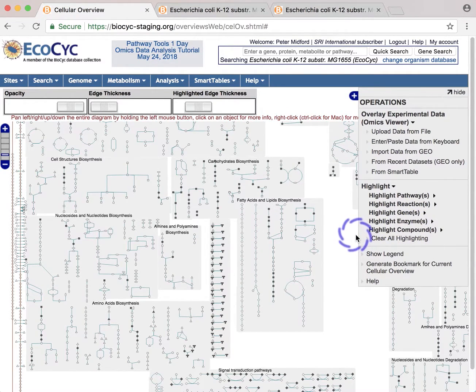For each kind of thing that you can highlight, there are multiple ways you can specify the particular individual or subset of the kind that you want to highlight. All kinds support searching by full name or entering a substring, which will pop up a list of choices. The more characters you provide in the substring, the shorter the list.